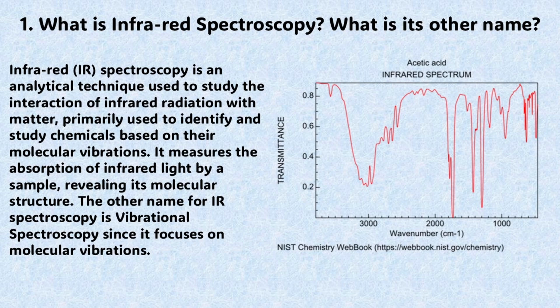It is also known by another name. The other name for infrared spectroscopy is vibrational spectroscopy, since it focuses on the molecular vibrations or transitions between different vibrational energy states of the same electronic energy state.